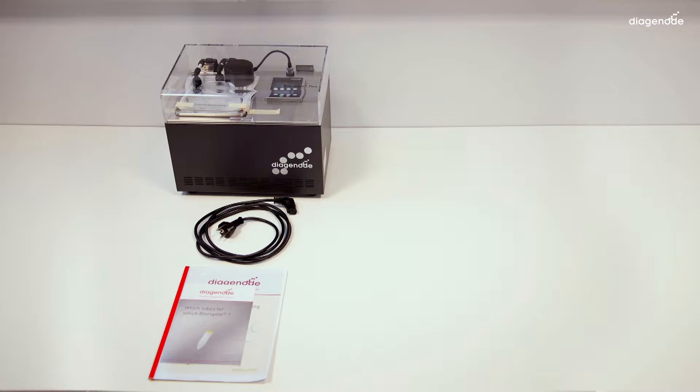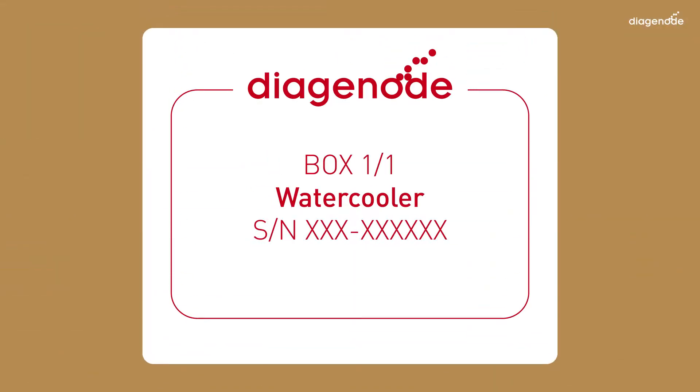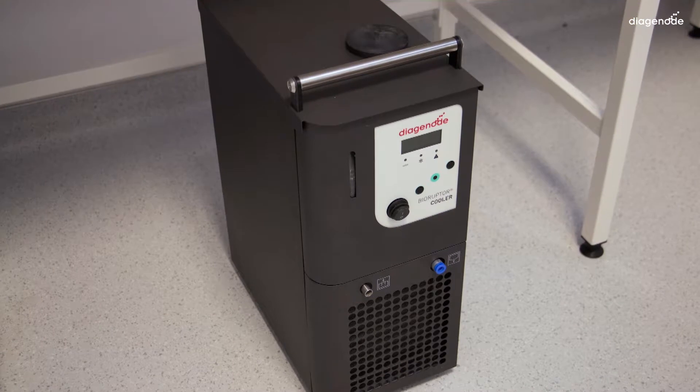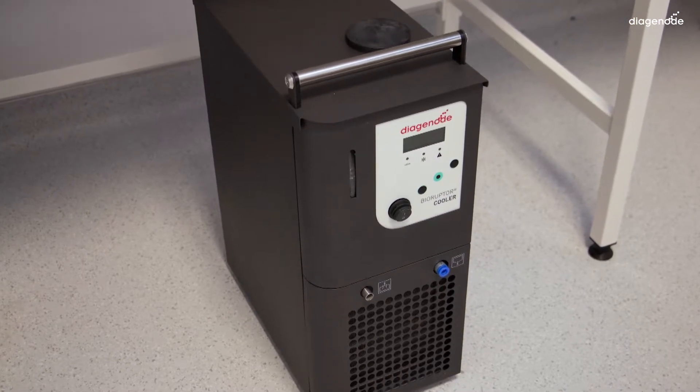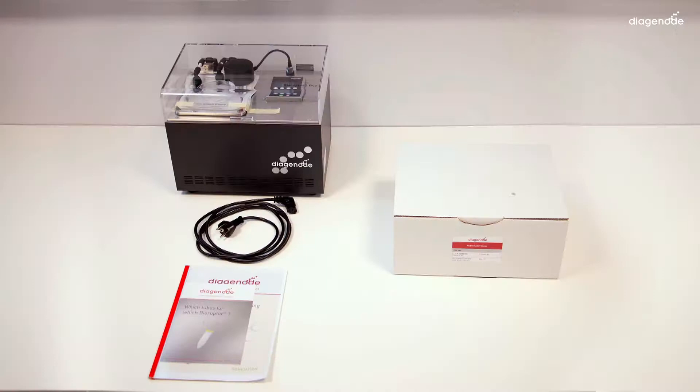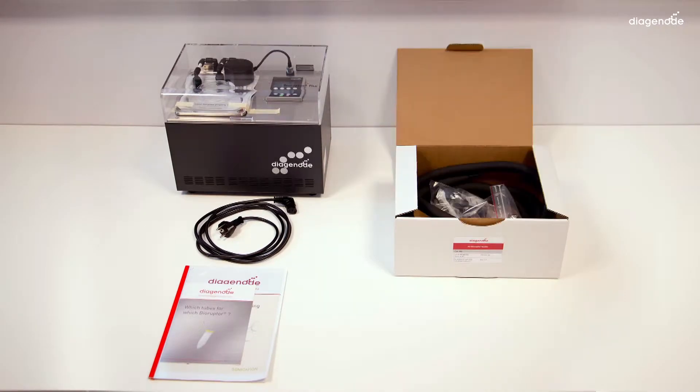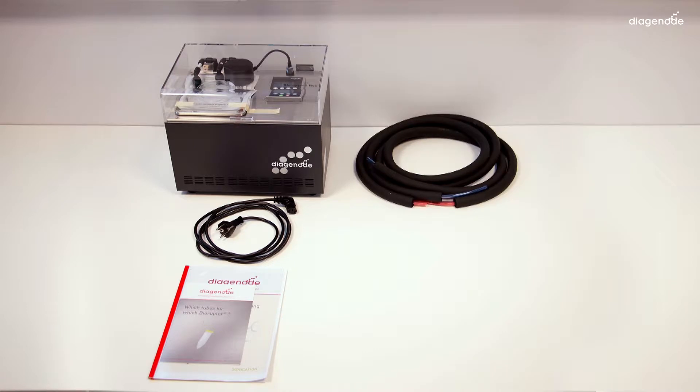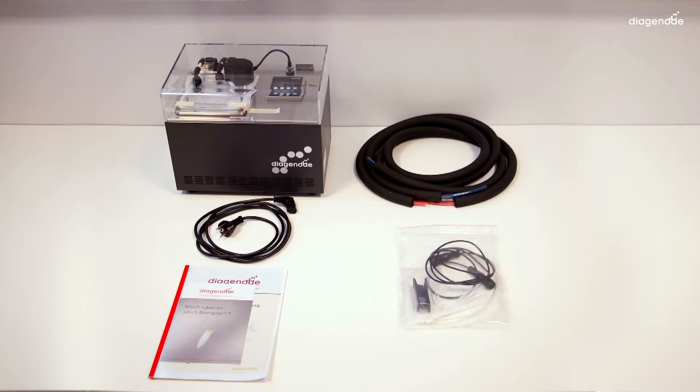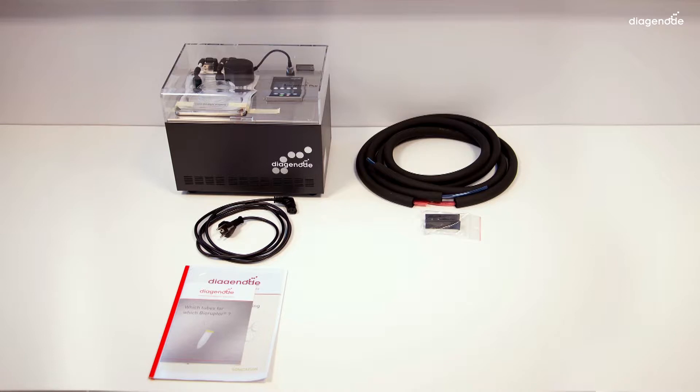Now open the water cooler box, which contains the water cooler system itself. And open now the kit for your chiller. You'll find inside the tubings - two tubes, one red and one blue.